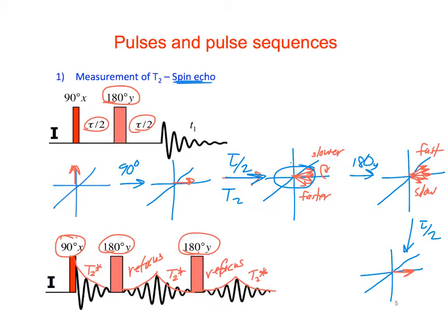All right, so notice as we go longer though, we keep refocusing it, the whole system is kind of relaxing like this as well. So there's another relaxation rate that goes like this, because the refocused ones are getting smaller and smaller. And so in the green, they say that this is the T2 value, and in red, the sharp relaxations are the T2 star. So with this kind of spin echo experiment, the way they're doing it, they say they can separate those two values.